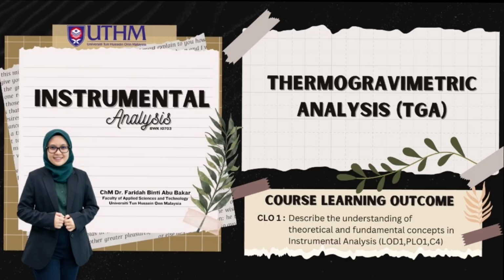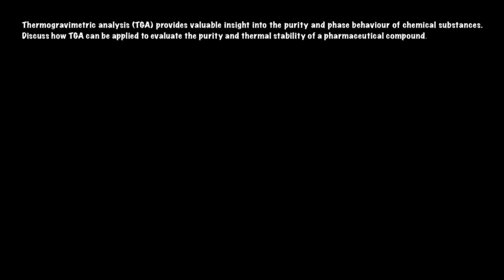In this video, we shall learn about the TGA. Thermogravimetric Analysis (TGA) provides valuable insight into the purity and phase behavior of a chemical substance. Discuss how TGA can be applied to evaluate the purity and thermal stability of a pharmaceutical compound.